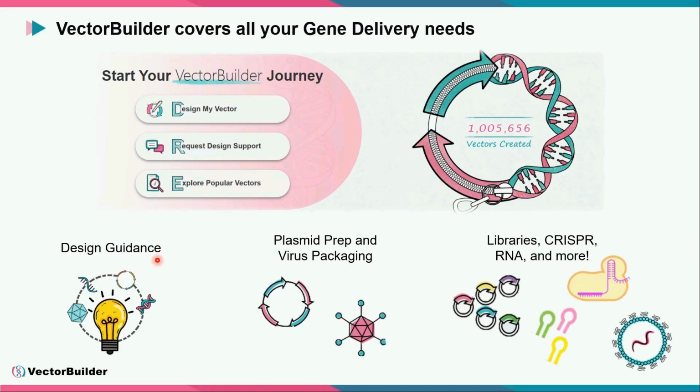And we're realizing how important that design guidance is, because we've recently put out a paper that found that for the vectors that we received from various different labs and industry partners, if they wanted downstream services, when we performed some basic QC on those vectors, more than half of them contained either design or sequence errors.